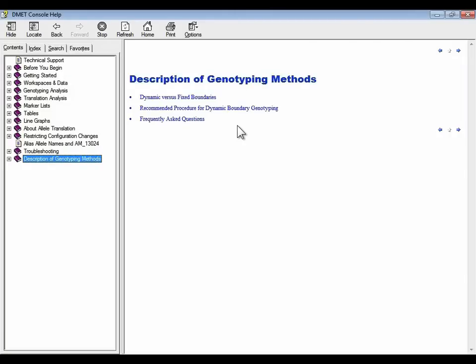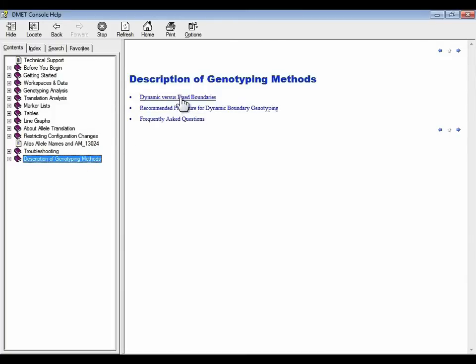To learn more about these methods, you should go to the DMET console help. Towards the end, there's a description of genotyping methods. Let's look at dynamic versus fixed boundaries.